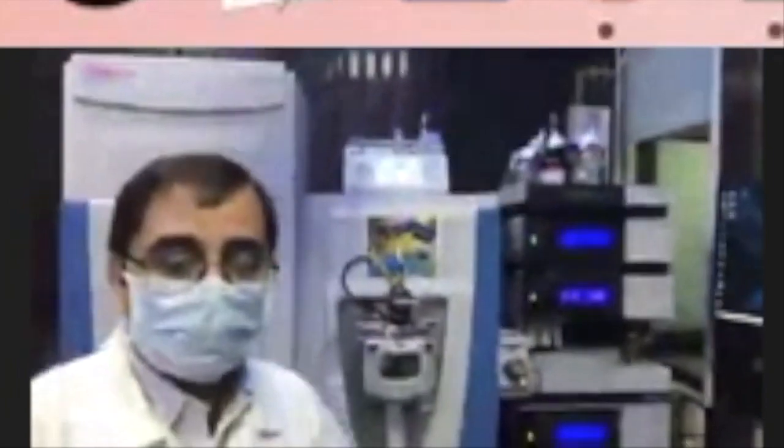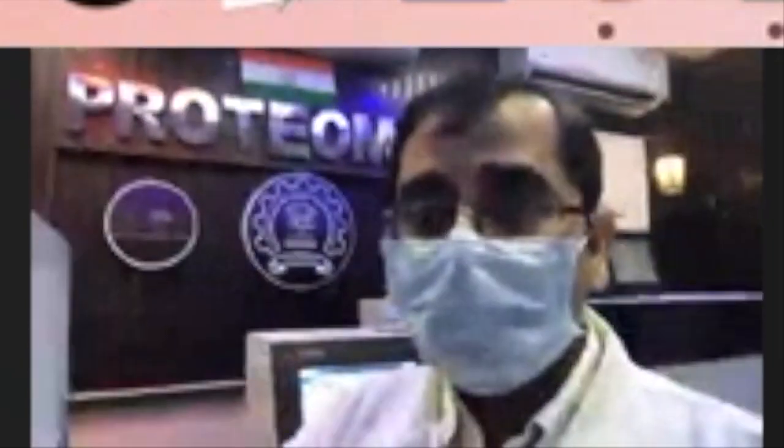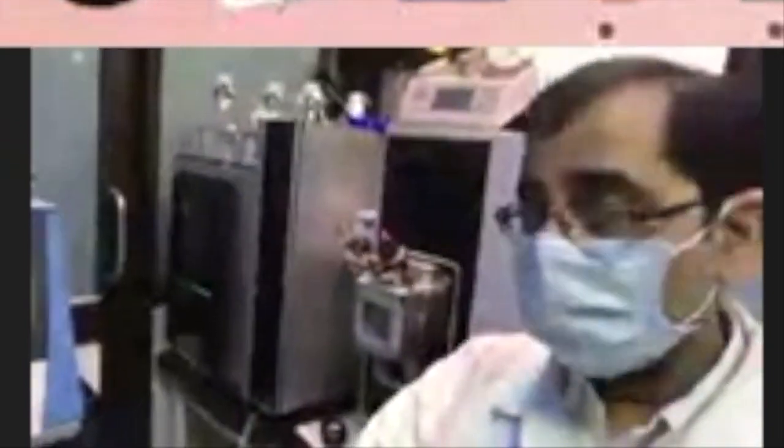This is another type of mass spectrometer, a Q-Exactive mass spectrometer, which is linked with the UHPLC, which we are using for generating additional data at the metabolite level, the metabolomics level. So this is the metabolomics data set which we generate here, and additionally one could also generate specific peptide or protein sequence data, looking at targeted validation of peptides that we monitor in this instrument, which is the triple quadrupole mass spectrometer.